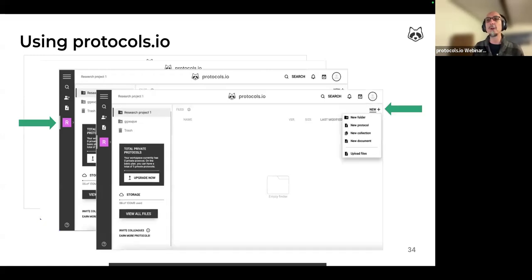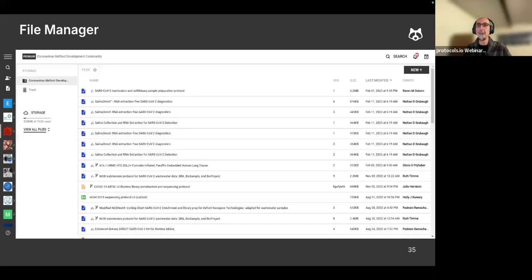And to start creating protocols, you go to the new button to the right. The file manager will eventually contain, display, and organize the protocols you have created within the workspace, as you see in this example.